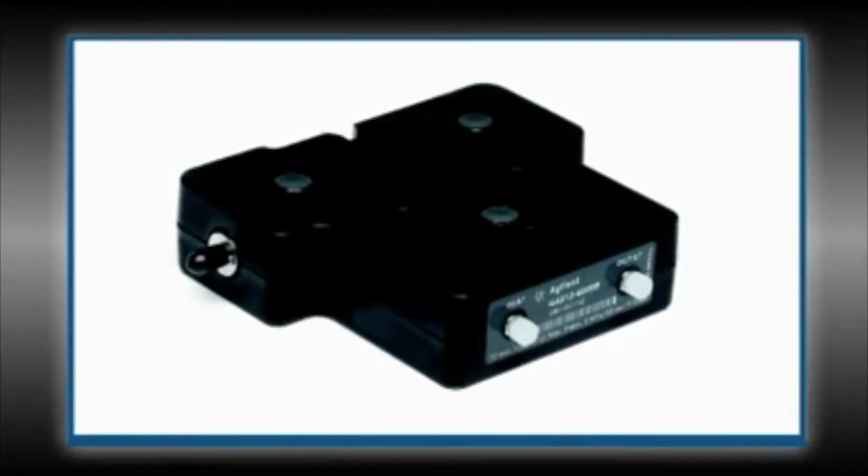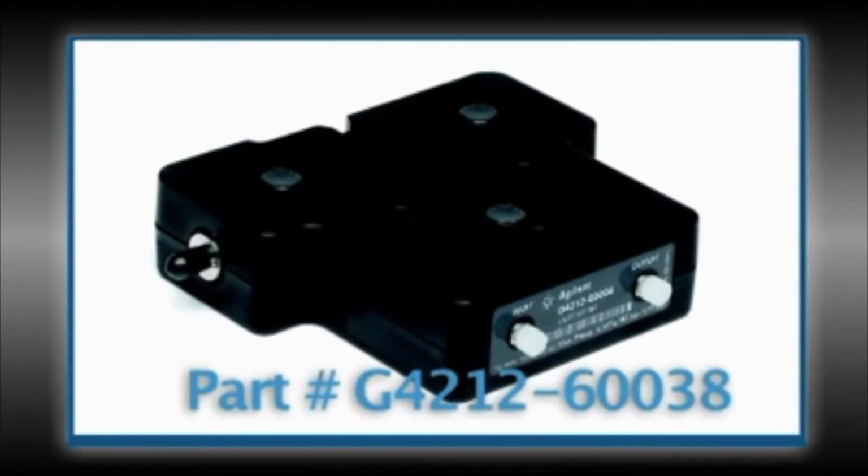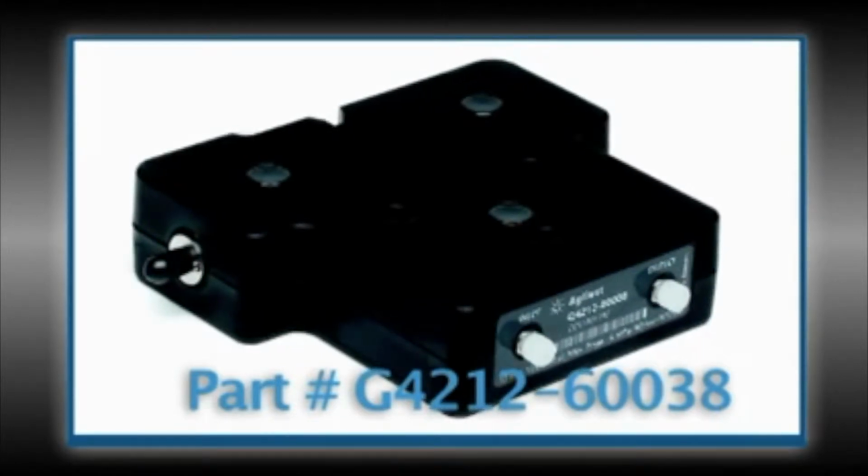Agilent has introduced a new ultra-low dispersion flow cell called the Agilent Ultra-Low Dispersion Max Light Cartridge Flow Cell, which is recommended for the 1290 Infinity LC diode array detector. Older instruments may have a larger volume flow cell, which can affect your results, so it's good to check.